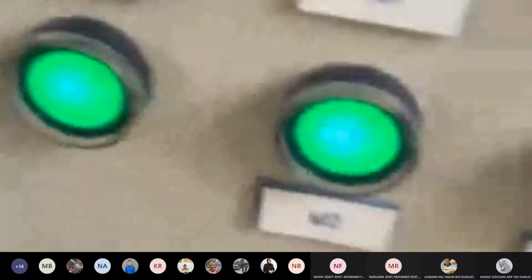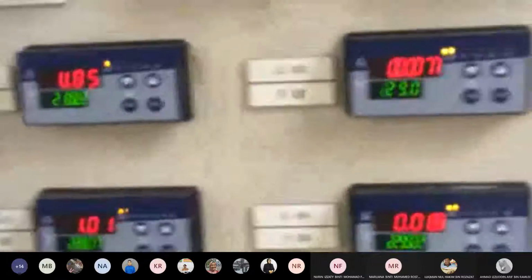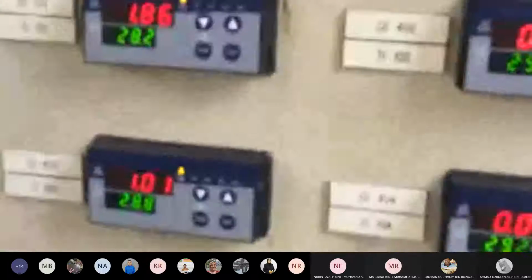Okay. Right, so you got M2, M3, M4. Why is it switch on? It's the stirrer for the reactor in series. So kamu boleh nampak kan stirrer dia? See the stirrer. Okay, alright, so done. Then kita tengok indicator. Kamu tengok ada 4 indicator. So many indicator, right? Okay, why? We go one by one.